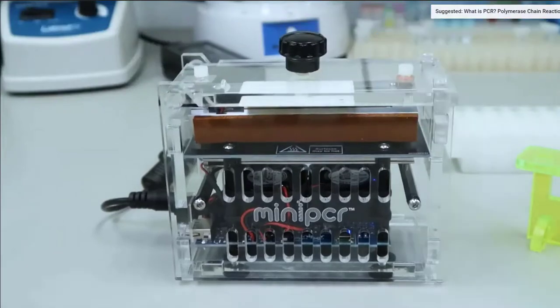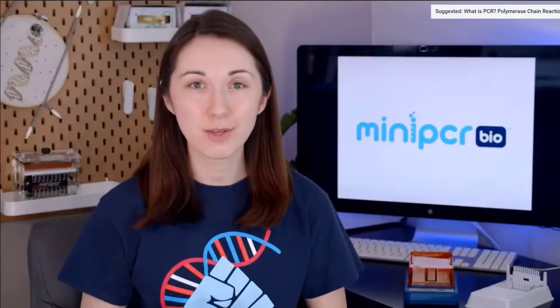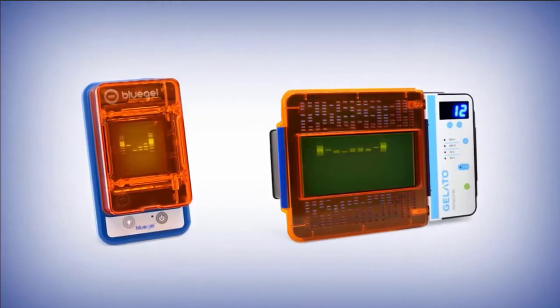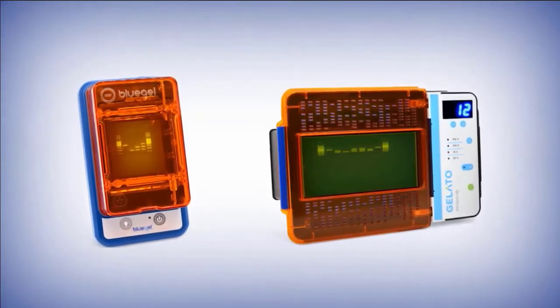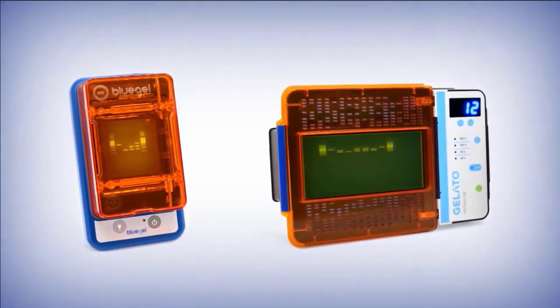You can learn more about PCR by watching our video linked below. Gel electrophoresis is an invaluable tool in the molecular biology lab, allowing us to visualize and analyze DNA. Blue gel and gelato electrophoresis and visualization systems from Mini-PCR Bio make this process efficient, easy, and economical. To find out more about the blue gel system and Mini-PCR Bio learning labs that can help to bring gel electrophoresis to your classroom.